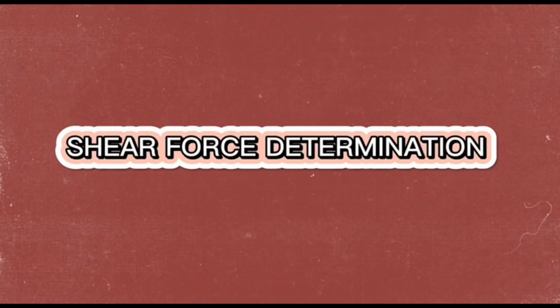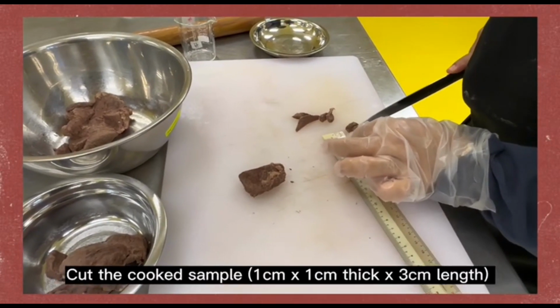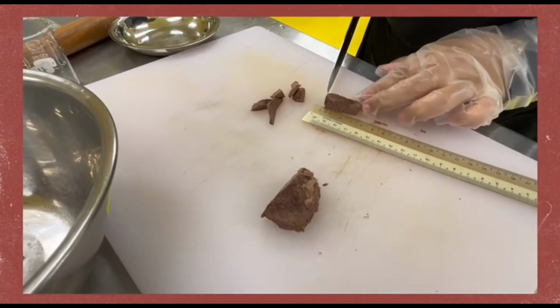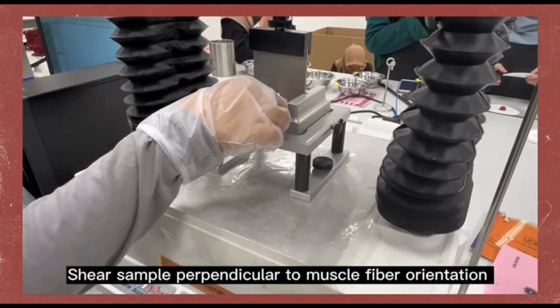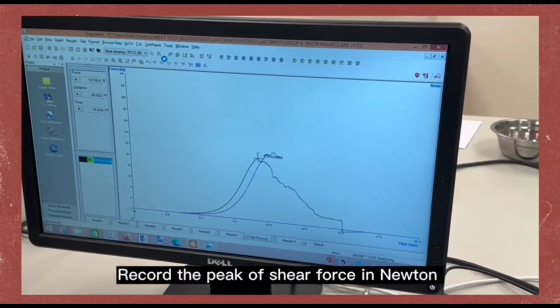Shear force determination. Cut the cooked sample 1 cm by 1 cm thick by 3 cm length. Shear the sample perpendicular to the muscle fiber orientation. Record the peak of shear force in Newtons.